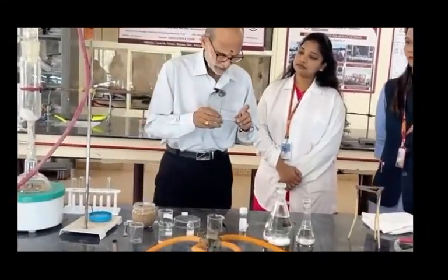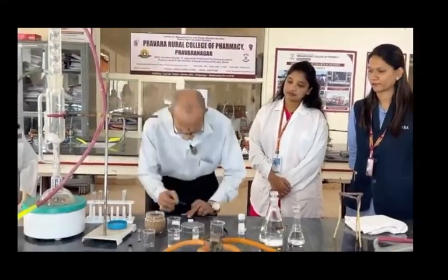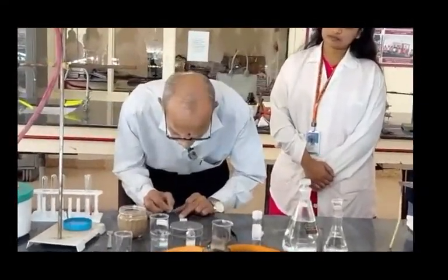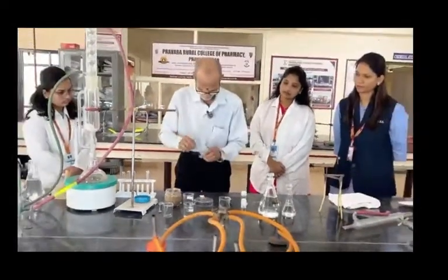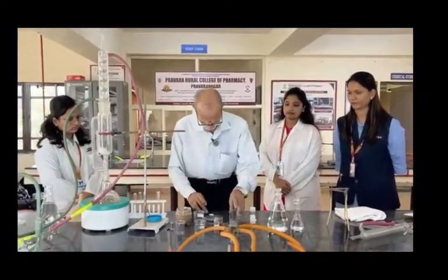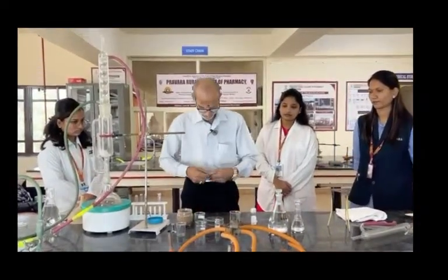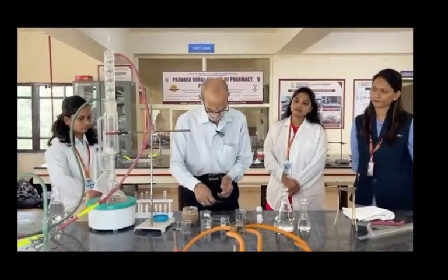And on the right, I will be putting the methanol extract from our bottle sample, from which we are going to do the methanol extraction. So you need not take a new capillary every time. The same capillary you can reuse after washing. Okay, so now spotting has been done. We have done the spotting, leaving 5 mm from the base.